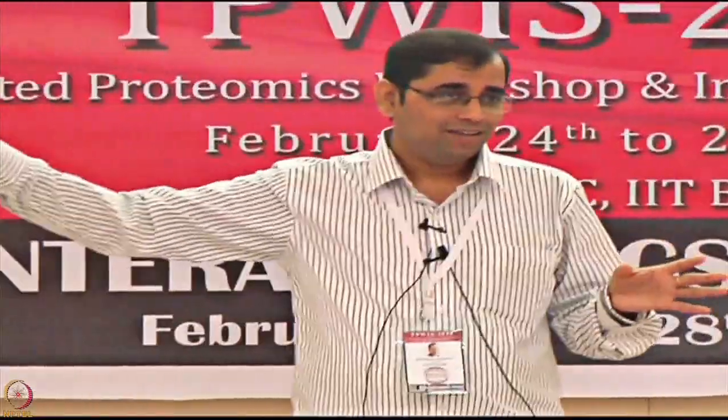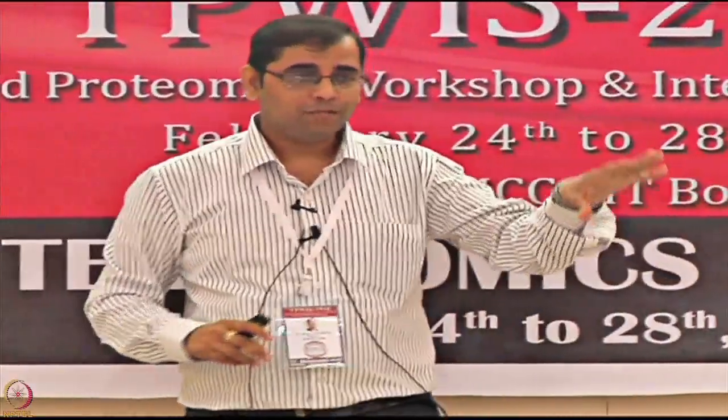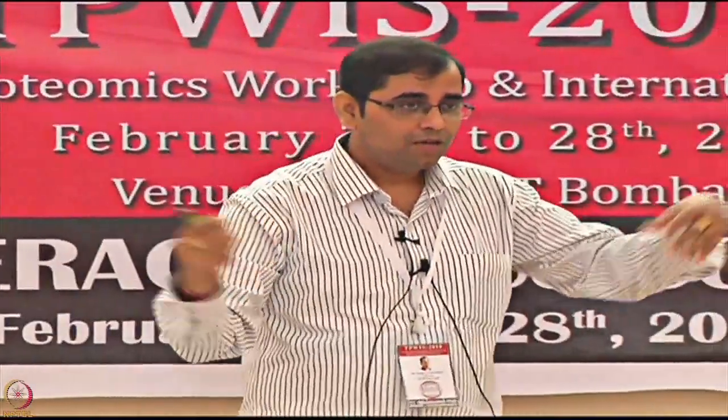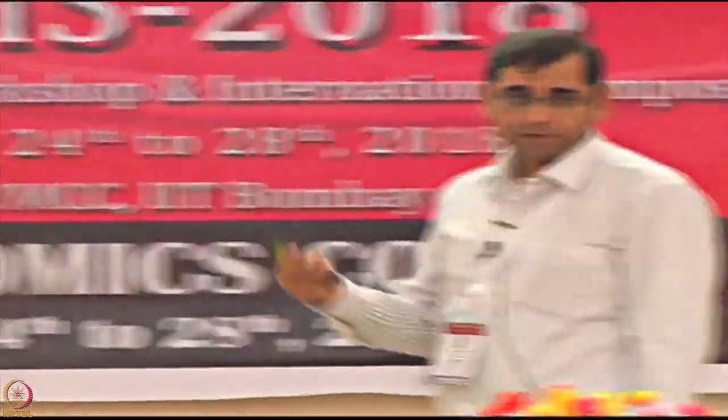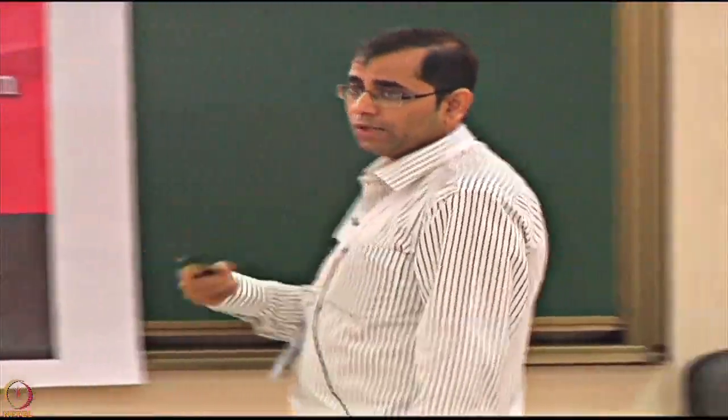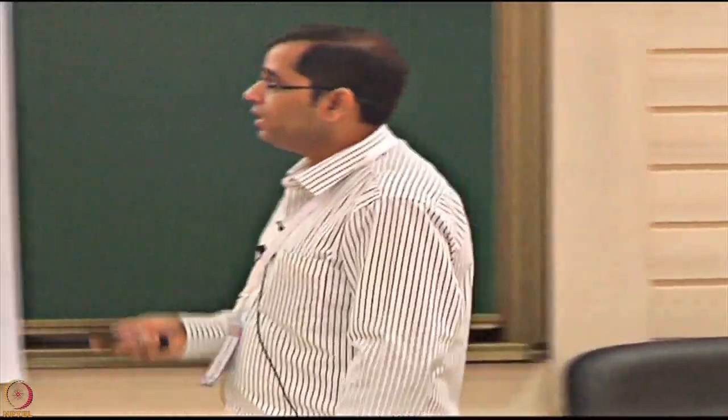Sometimes a good experiment may involve every technology which we are studying in the different workshops right now here, starting from discovery with mass spec based and microarray based approaches, taking those leads forward and then validating using these kinds of label free platforms. So everything has its own utility, and you have to pick the technologies in the right context.